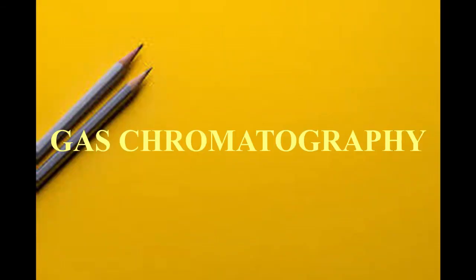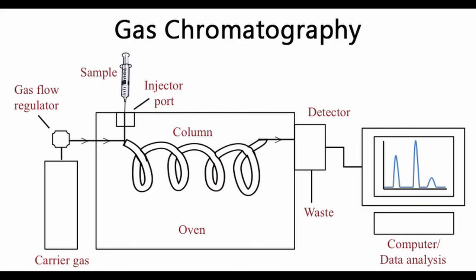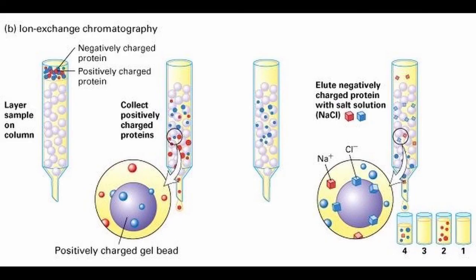Gas chromatography is a common type of chromatography used in analytical chemistry for separating and analyzing compounds that can be vaporized without decomposition. Ion chromatography separates ions and polar molecules based on their affinity to the ion exchanger. It works on almost any kind of charged molecule, including large proteins, small nucleotides, and amino acids.